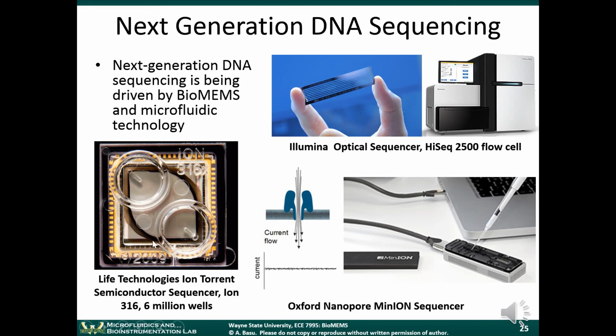This is really quite an amazing technology. It's actually the marriage of microfluidic technologies with semiconductor technologies with chemical sequencing. The guy who came up with this technique is a genius. His name is Jonathan Rothberg. He actually figured out this optical sequencing, and then later he went on to invent this technology also. It's quite an amazing story if you read about Jonathan Rothberg. Great stuff.